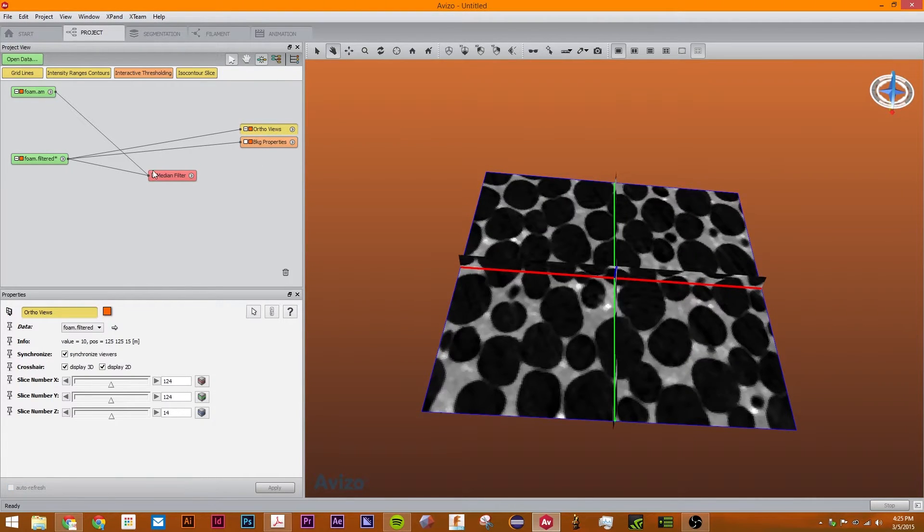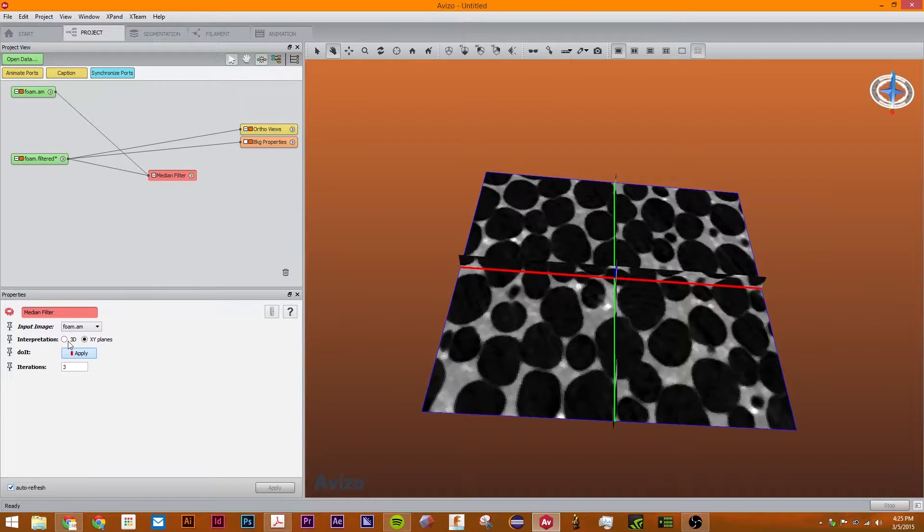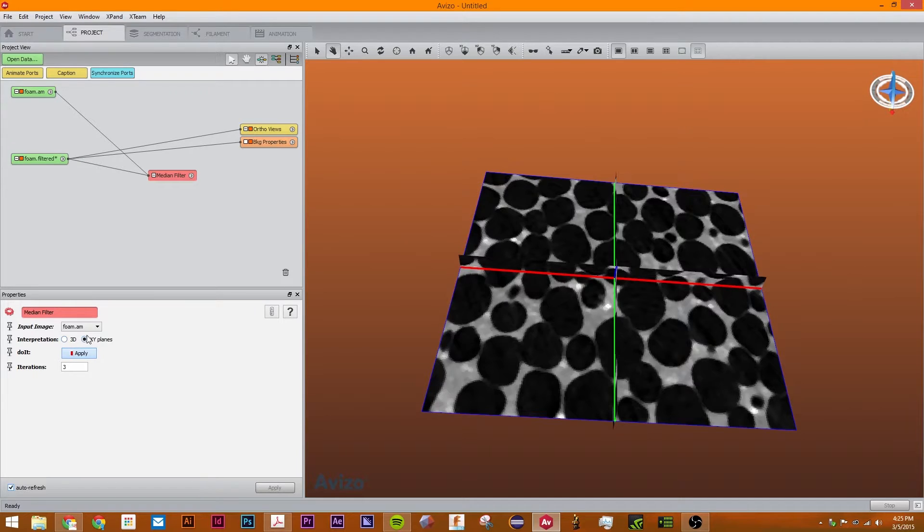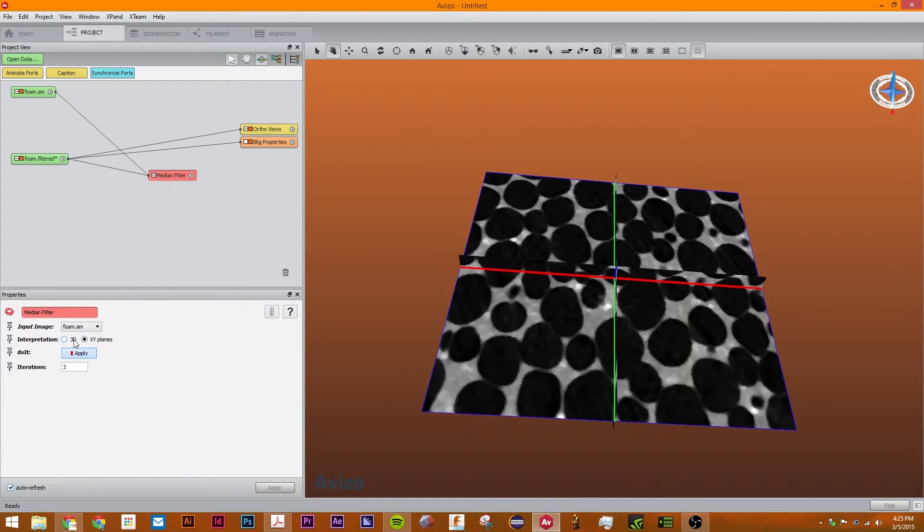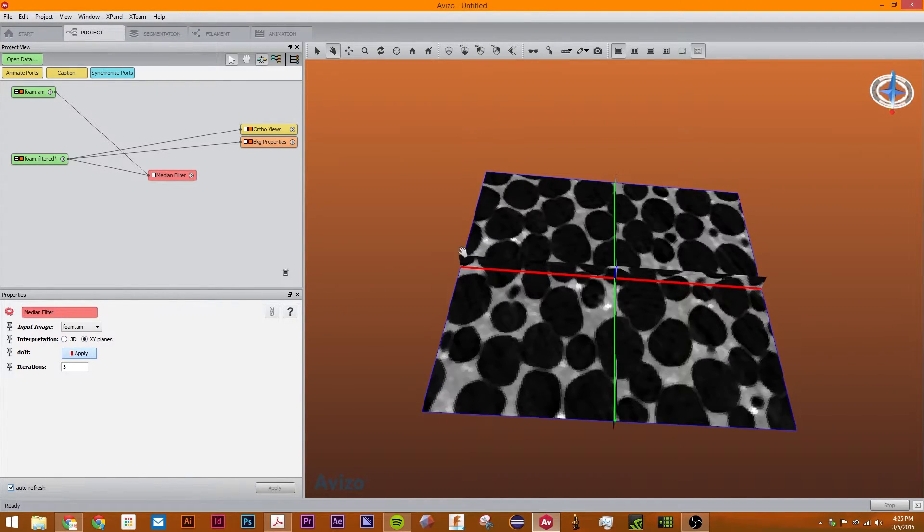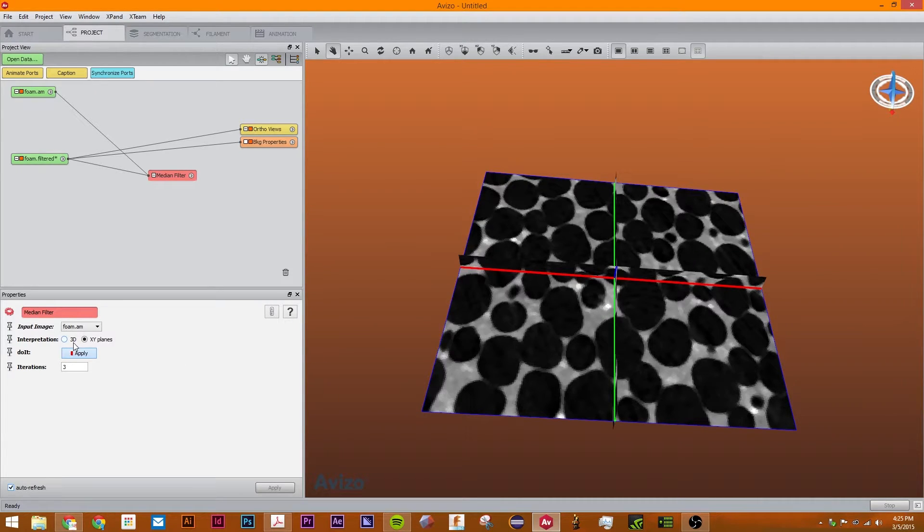Okay. So now that we have this we're just going to go to the median filter and try out different settings. The difference between xy planes and 3D is that in xy it will just take each slice and process it like that. With 3D it will process it by each voxel.